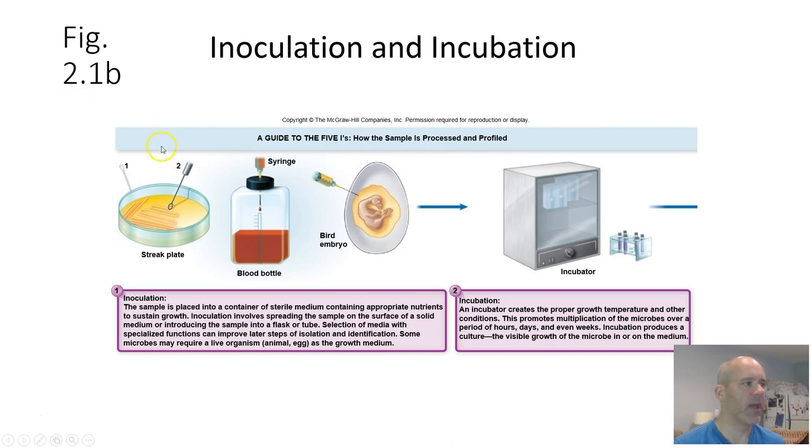And over here on the left, we've got a petri dish, and this has a substance in it called agar, which you'll be learning about in your Learn Smart Labs activity. It's kind of a gelatin-like substance that has nutrients in it. And so you can take bacteria. Bacteria love to grow on what we call agar media, with lots of nutrients in it.